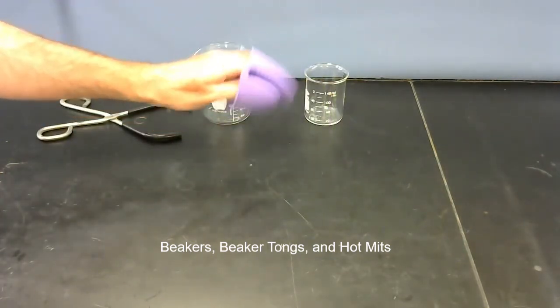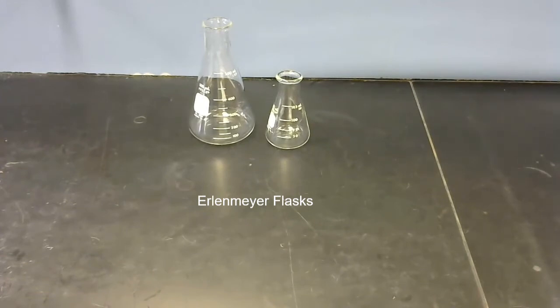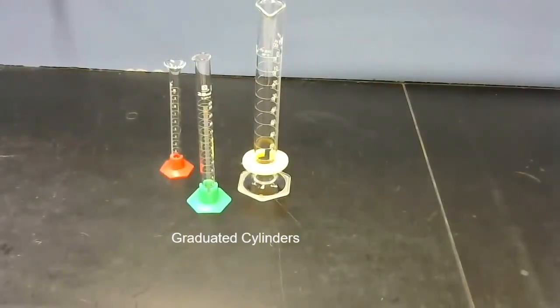These are Erlenmeyer flasks. Similar to the beakers, you can see there's some volume markings on there, but those volume markings should be considered approximate on the beakers and on the Erlenmeyer flasks.